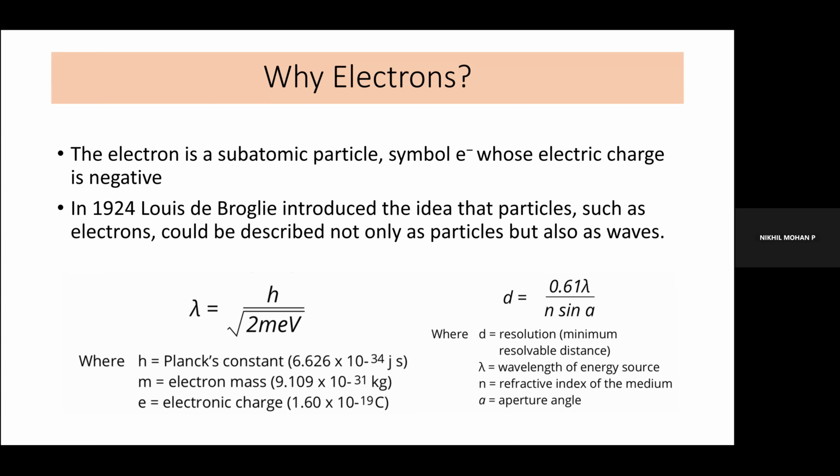First, using an electron gun, we generate particles, which may be an electron beam. For that, we should have a high voltage acceleration system. Like in common microscopes, we are using 80 kV, 80,000 volts, to 3,00,000 volts. That much acceleration is there.